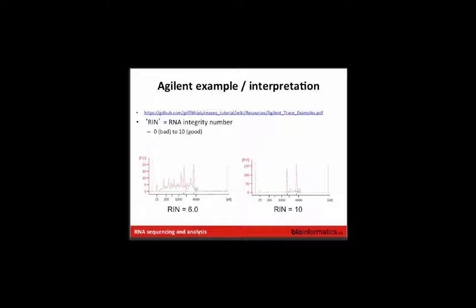Definitely, as someone who does analysis all of the time, I usually advise collaborators or other people against doing those kinds of end sequencing strategies, because it's usually about 5 minutes after I get the data and start looking at the results that they immediately ask, oh, how about alternative splicing? Or can you tell me what the expression level of this SNP or this mutation is? Or can you look for gene fusions? Basically, they immediately start asking a lot of questions that can't be asked because of the way the data was generated.